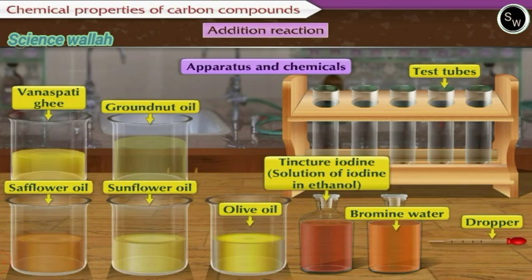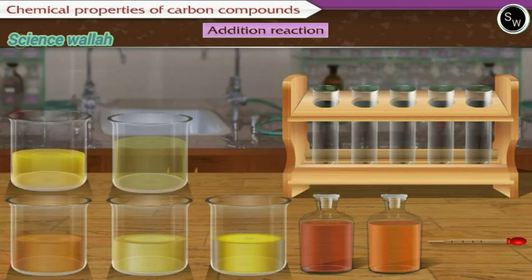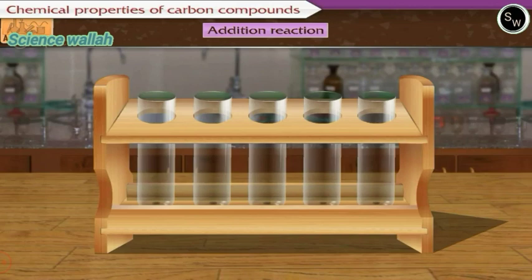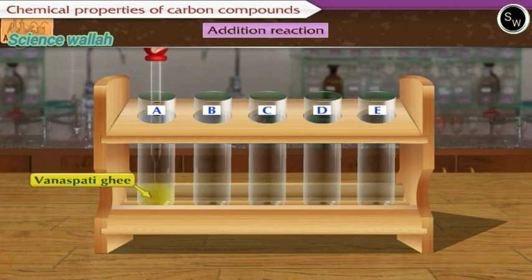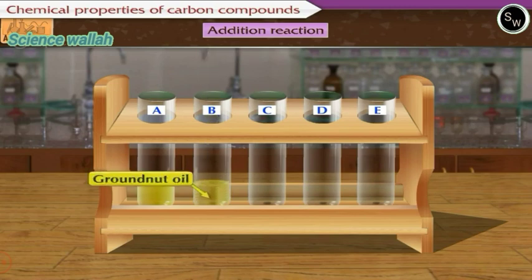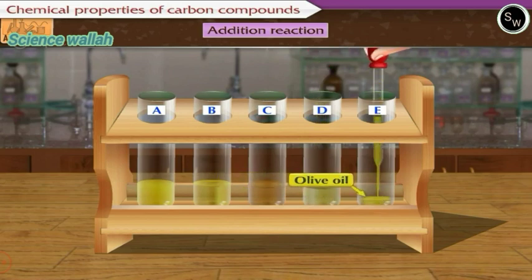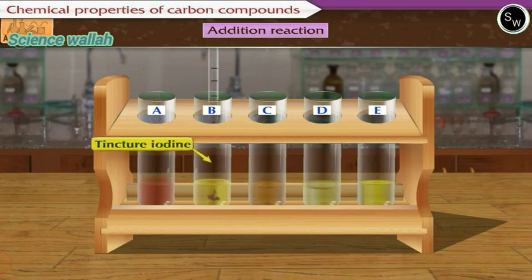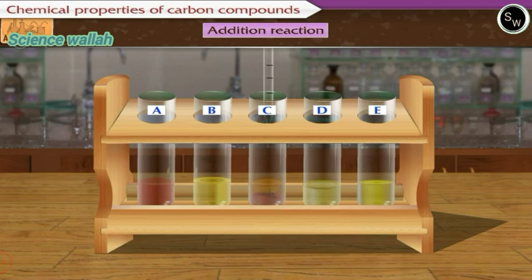Let us perform the activity. First, let us take five test tubes and label them as A, B, C, D, and E respectively. Let us take 2 ml vanaspati ghee in test tube A, and in the other test tubes take 2 ml groundnut oil, safflower oil, sunflower oil, and olive oil respectively. Now let us add four drops of tincture iodine in each of the five test tubes and observe.